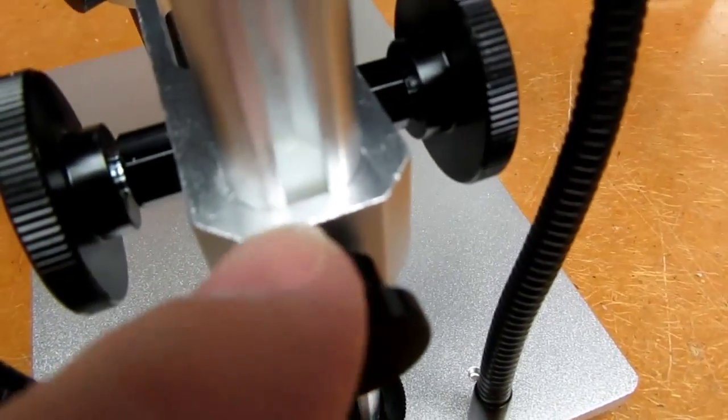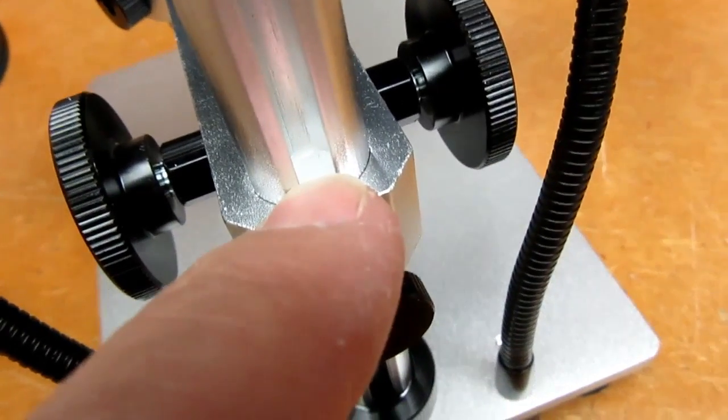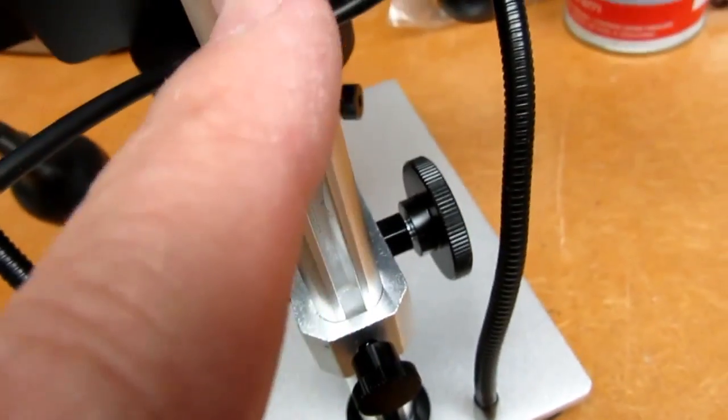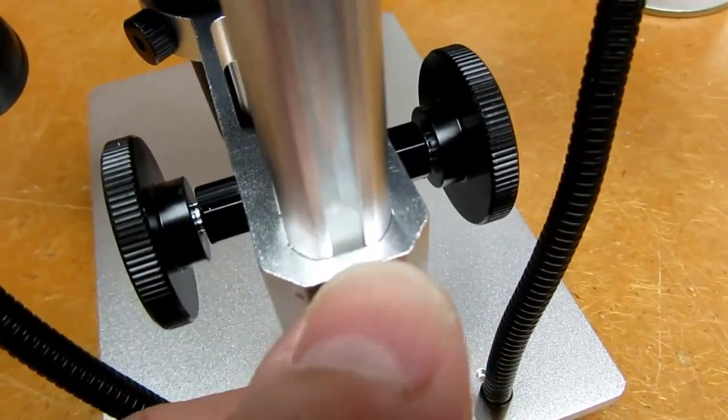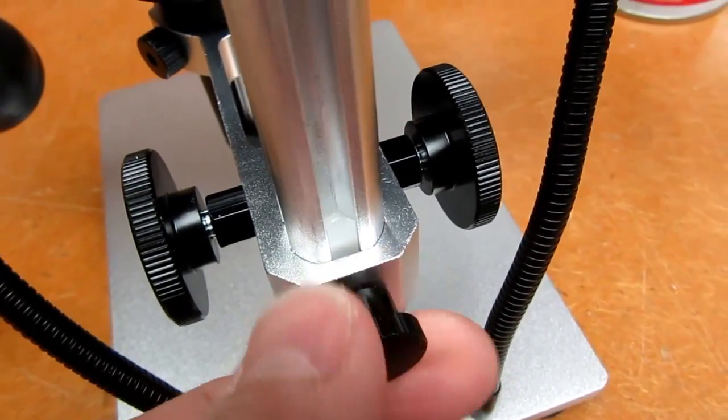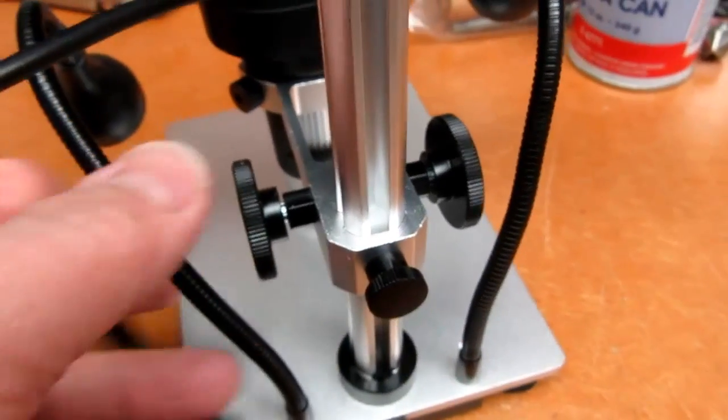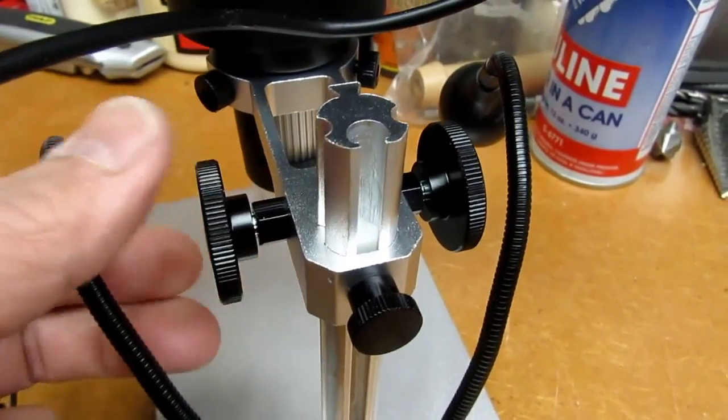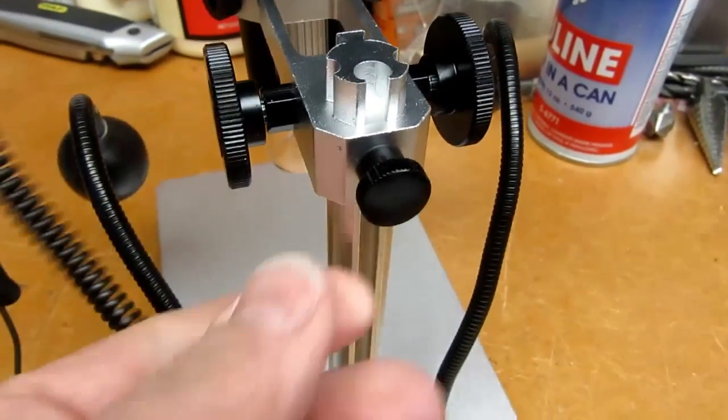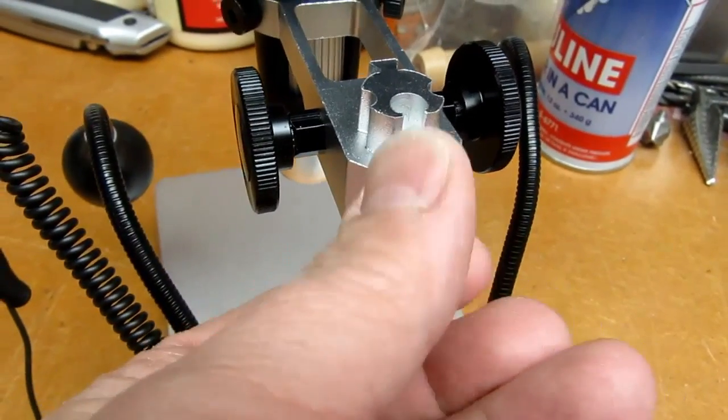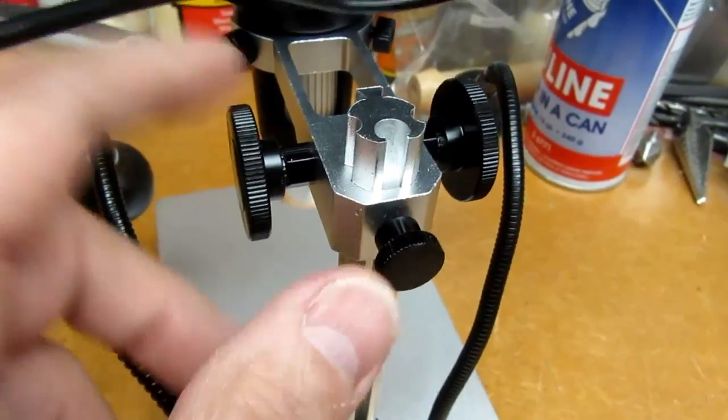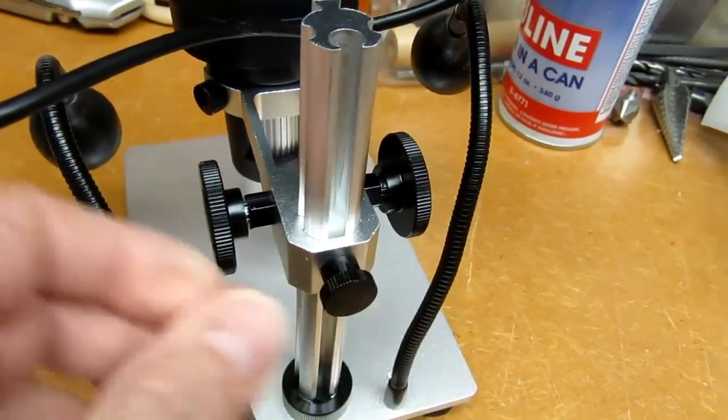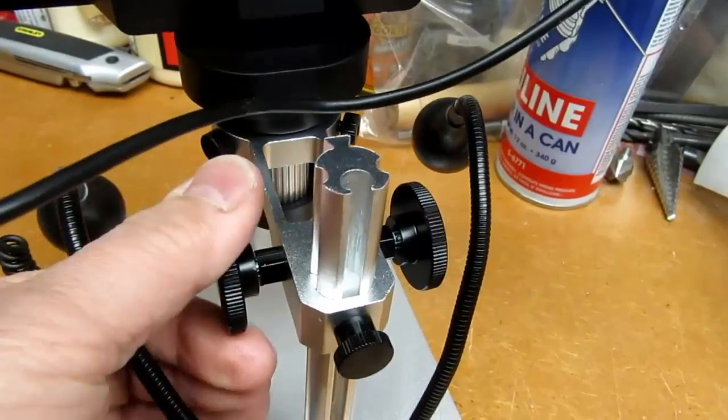These by the way are metal, this whole mechanism is metal, there doesn't seem to be a lot of plastic on here. When I said this has a lock on it or didn't have a lock, I may have misspoken. Okay, so it may not be too visible but there's sort of a plastic insert that goes in this groove and this screw puts tension against it. So this is what keeps it from settling down under its own weight. You just have this turned in all the way and then it has appropriate tension on it and it won't sag under its own weight.